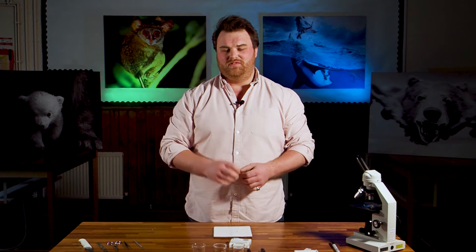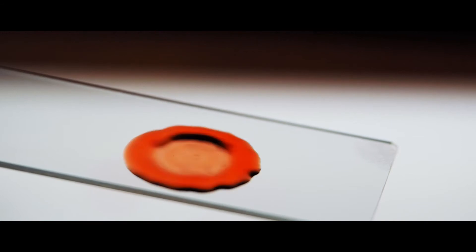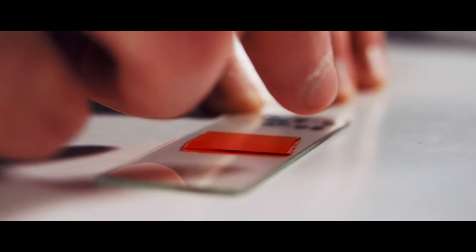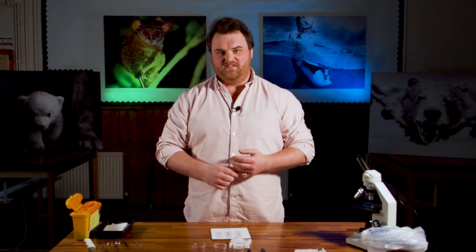So that's plant cells. Now we're going to have a look at some animal cells, and that means we need a blood sample — and that means a needle. We used a little sterile lancer just to prick the end of my finger and got a few drops of blood out. We're going to do exactly the same thing as we did with the onion: three drops, one in distilled water, one in an isotonic 0.85% salt solution, and one in 2.5% salt — and see what happens to all three.